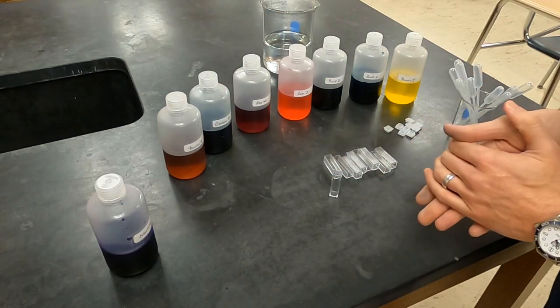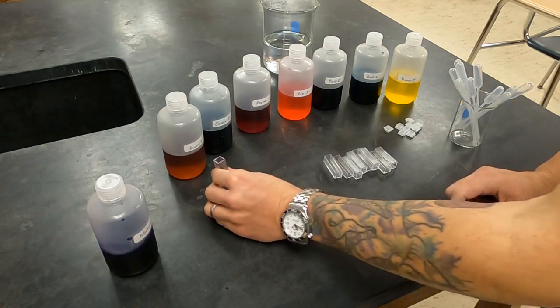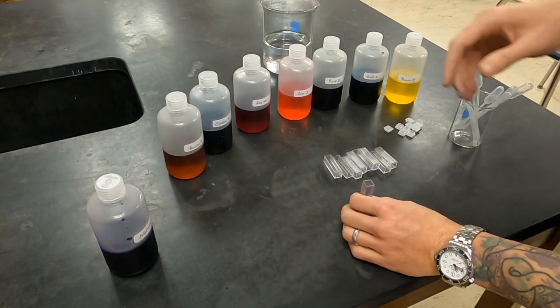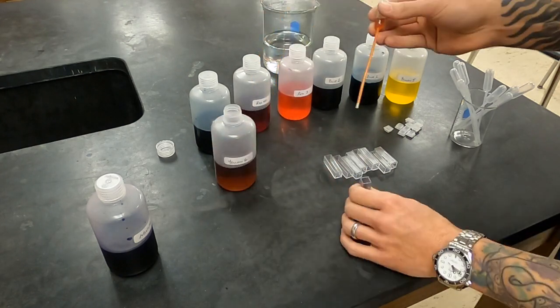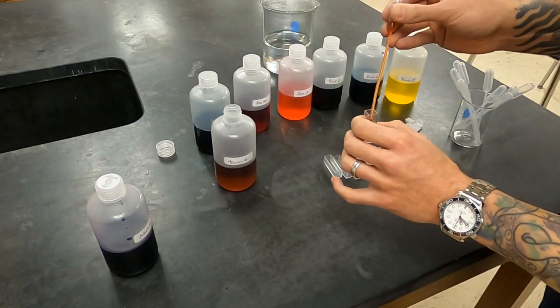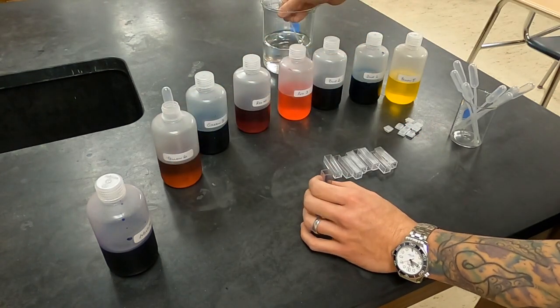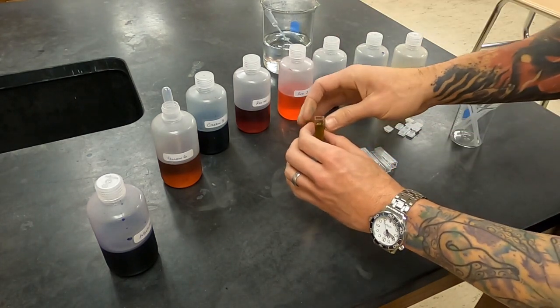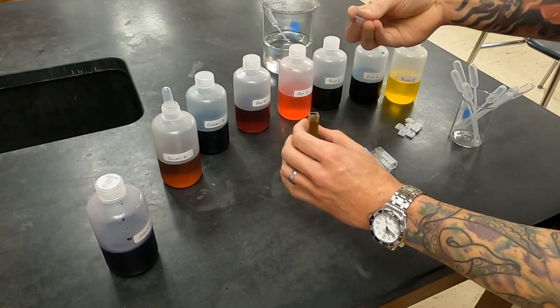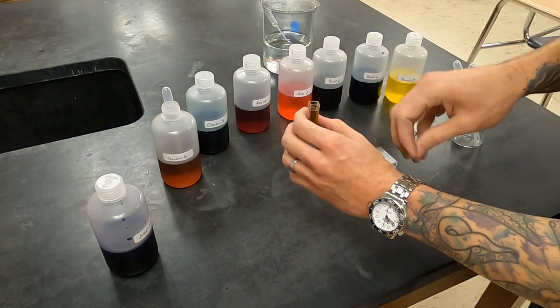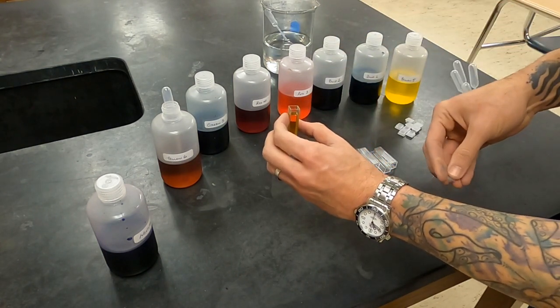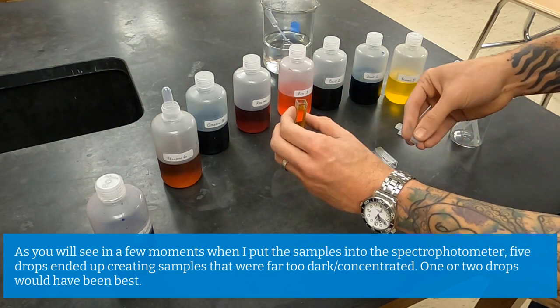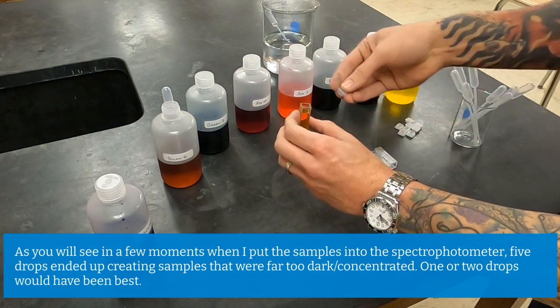It's important to keep track of which cuvette is which, so as I prepare them I'm going to set them in front of the sample. Now you don't want to fill them completely to the top or you'll make a mess when you put the cap on. Notice I put in five drops for the yellow six and I'm going to try to be consistent with that five drops for all the remainders.